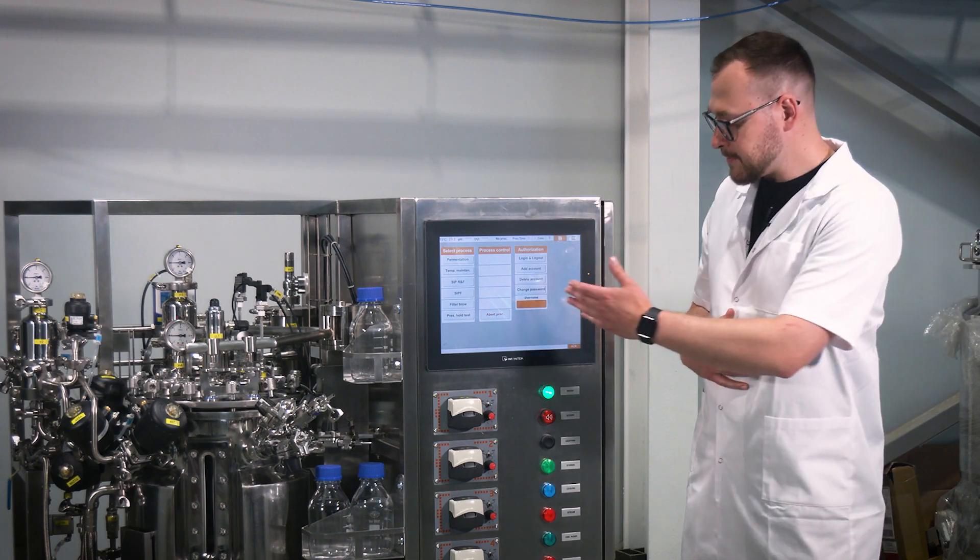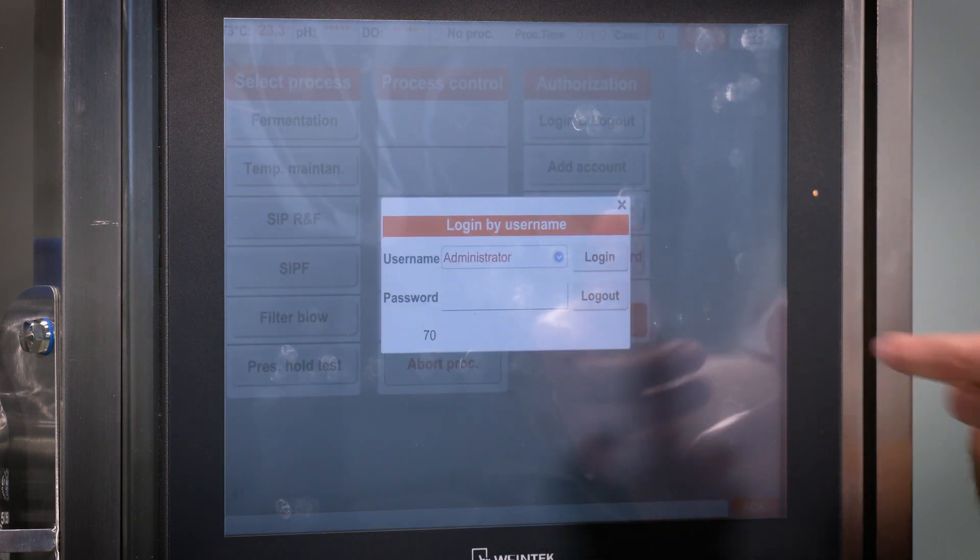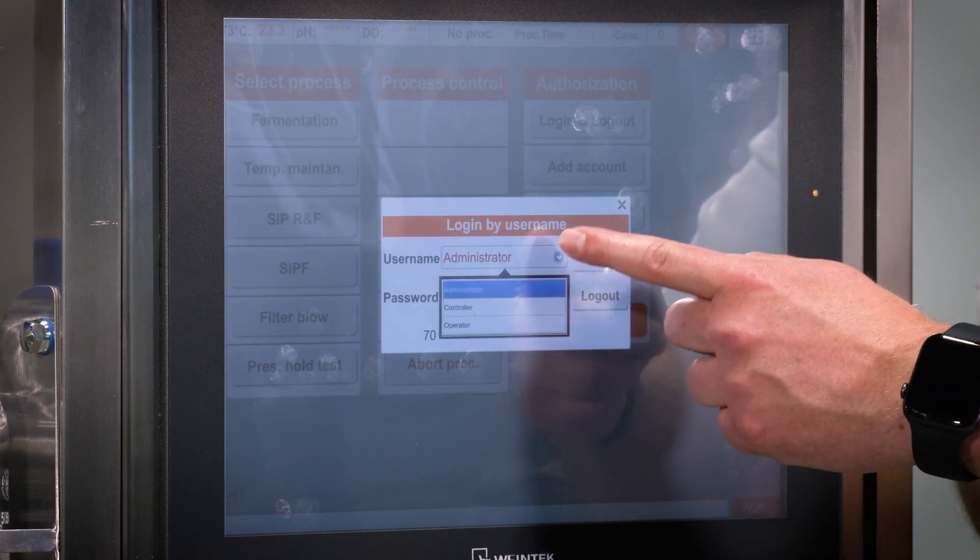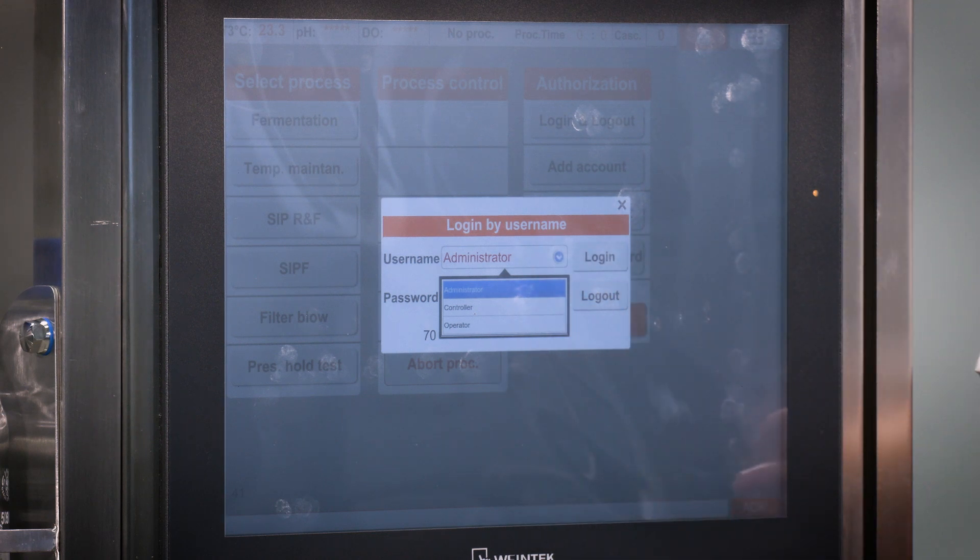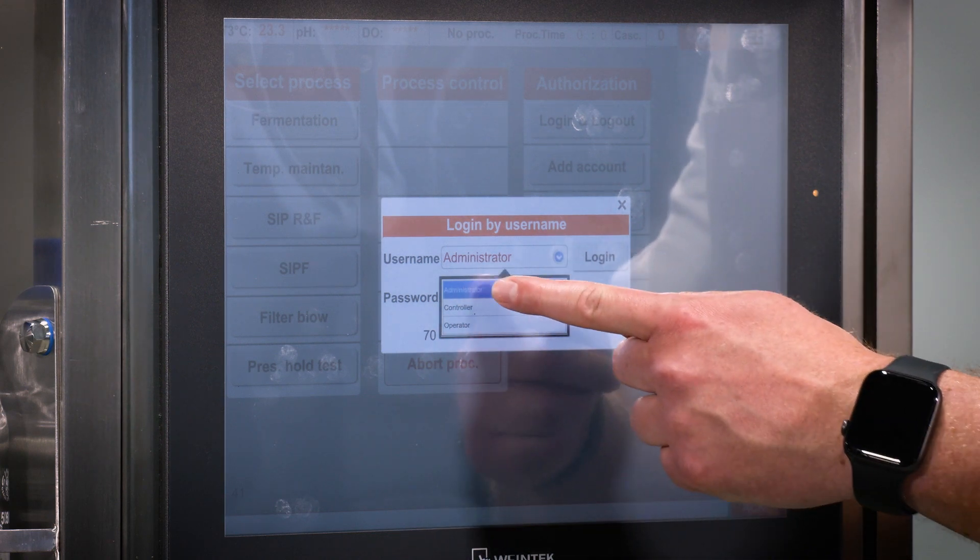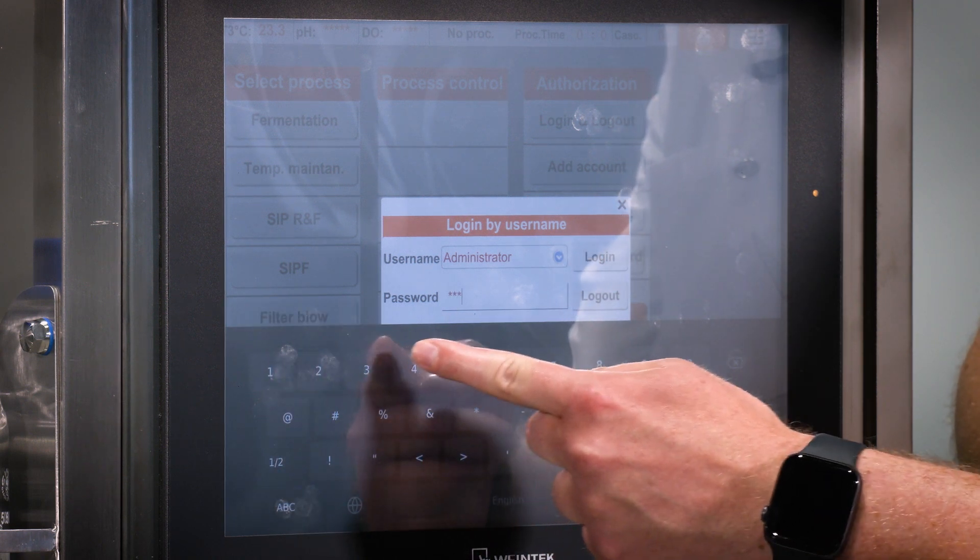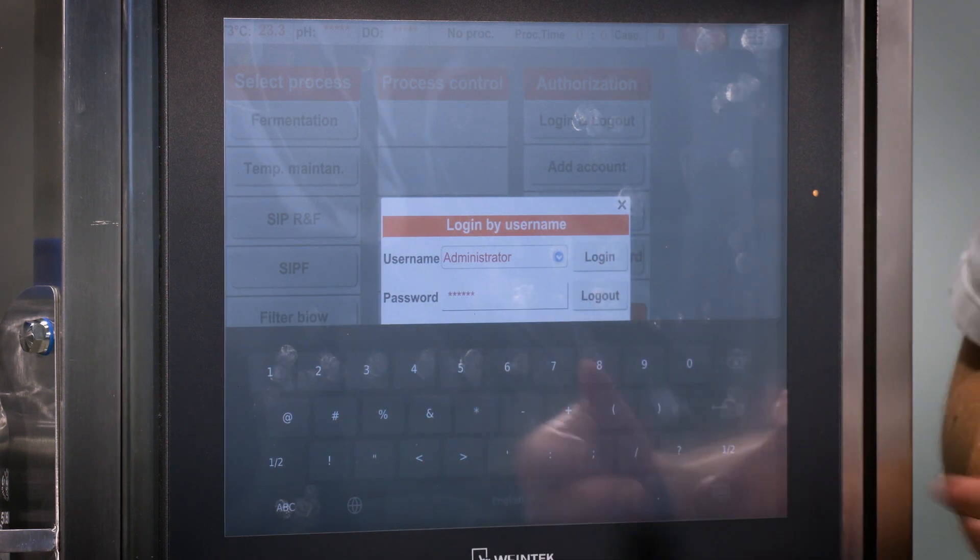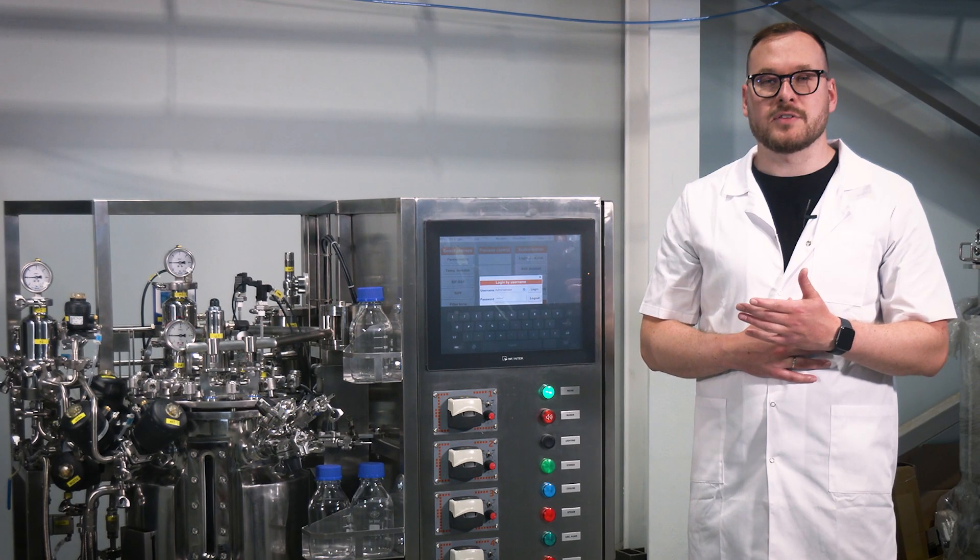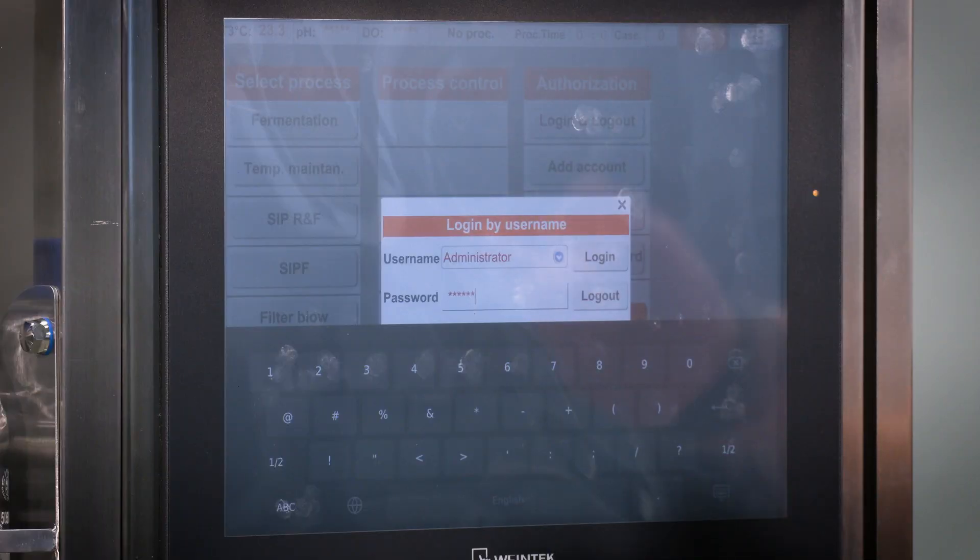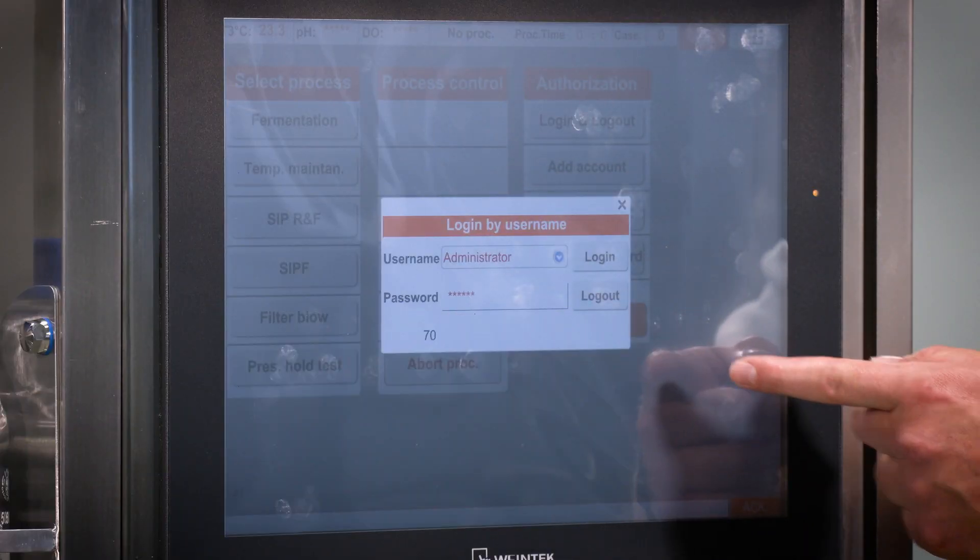In the authorization section, choose the desired access level: controller, operator or administrator. Enter the respective password by clicking on the blank space next to the word password and press enter and log in.